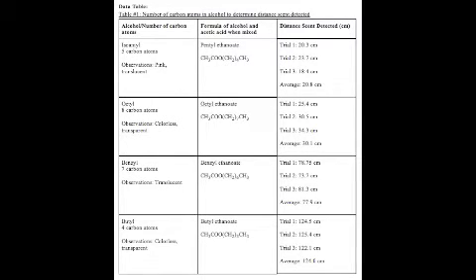According to the data we gathered, there is no correlation between the number of carbon atoms in an ester and the distance at which the scent of the compound is detected. This differs from our expectations, as we expected there to be an increase in the distance at which the scent would be detected as the number of carbon atoms in the ester increased.